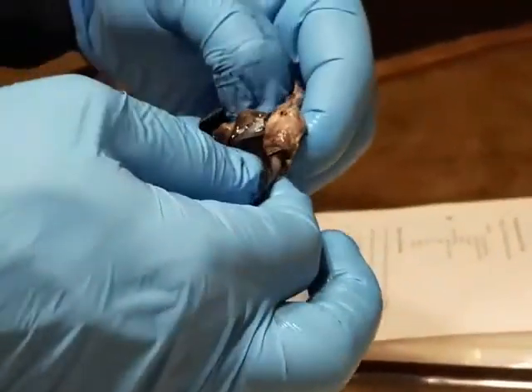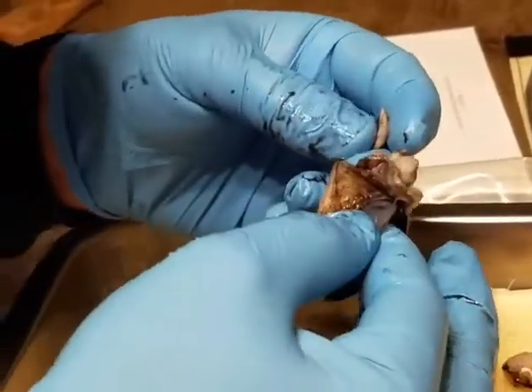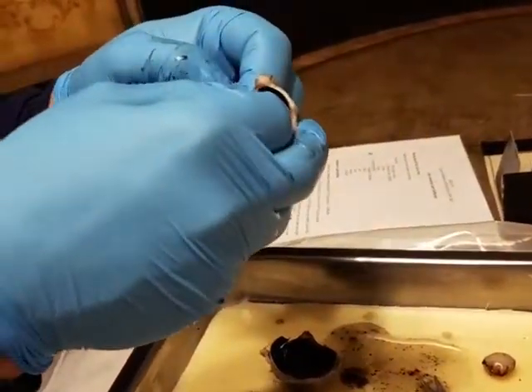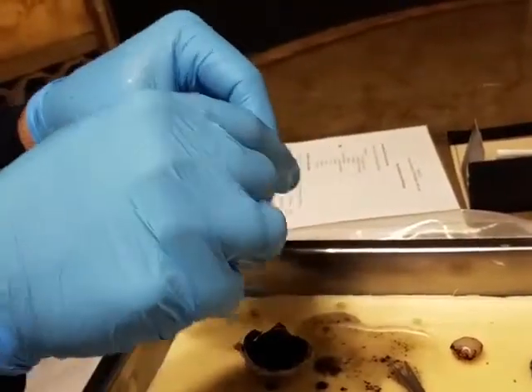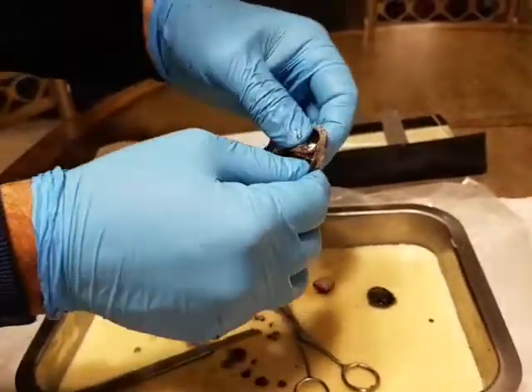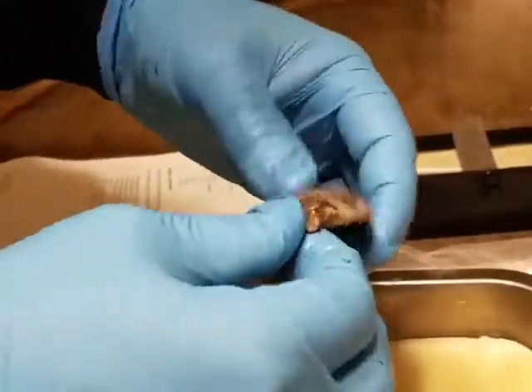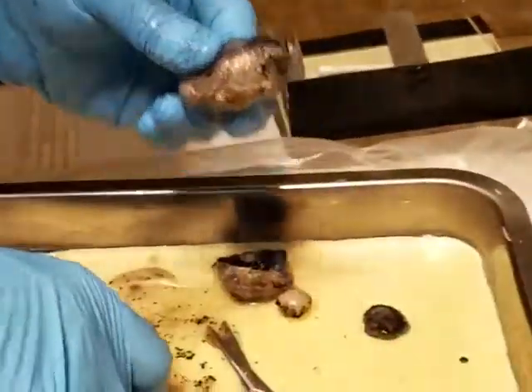Now this right here, just pulling it apart now. This is the scleria, the white part, and then below that is the choroid layer. I'm trying to see, but this is the choroid area right there, or is that still the eye? That's still the eye, but it's right below the scleria area.